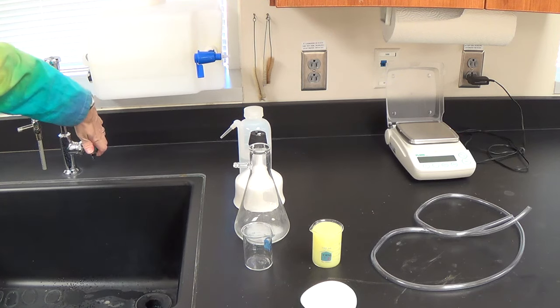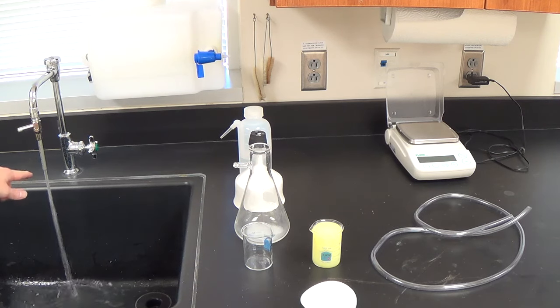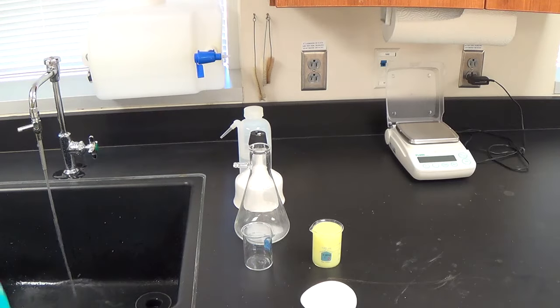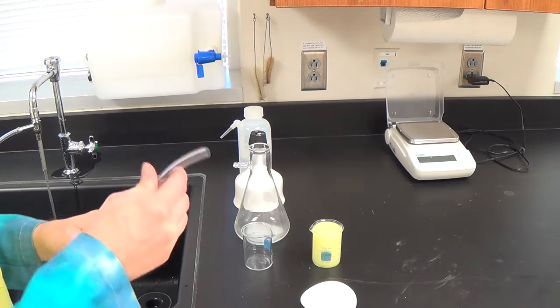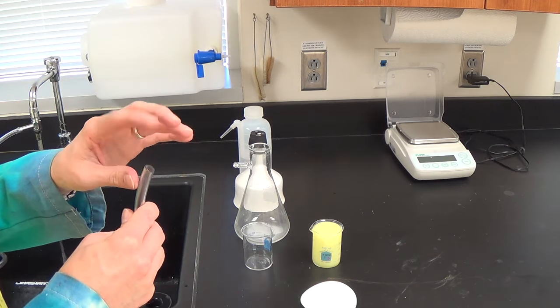What's going to happen is as you turn on the water, you're like, well, la-di-da, the water still comes out. Yes, the water is still coming out, but now it's pulling air in through this valve here. So we're going to take a hose, and we're going to have our hose on there. There we go. Makes a really nice seal. We're going to have our hose attached to that jet so that now we're getting vacuum. We're actually getting air pulled through here.